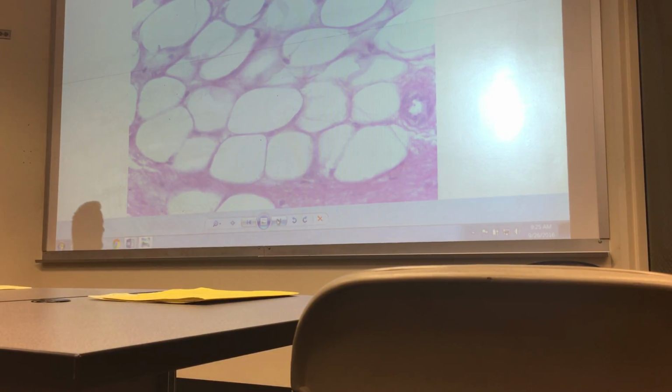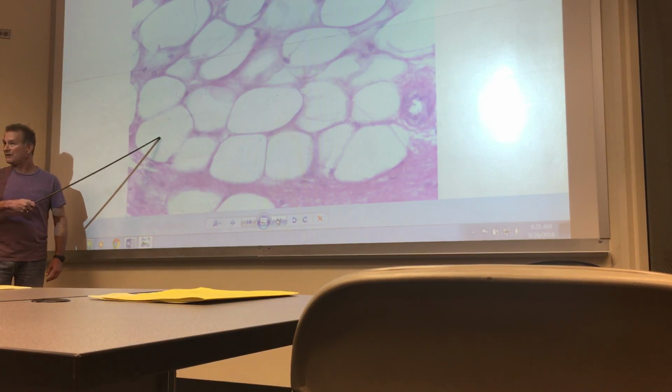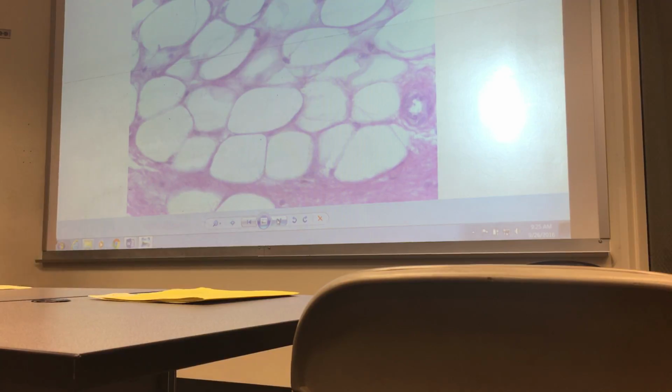This is, of course, adipose connective tissue, an example of where, hey, it's not difficult, it's just kind of picky. So name this tissue. Don't write down fat, write down adipose connective tissue. And if you want to use CT and ET, that's fine. You can use CT and ET throughout the practical examination. What do these cells store? Don't tell me they store fat, tell me they store triglycerides. It's kind of like, say, erythrocyte, leukocyte, thrombocyte, not RBC or red blood cell.